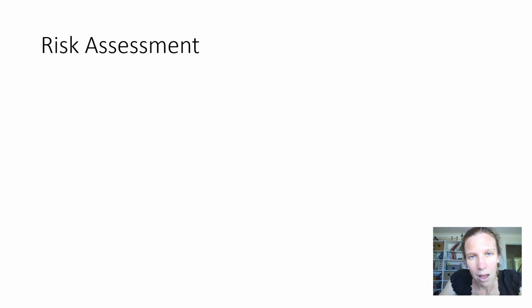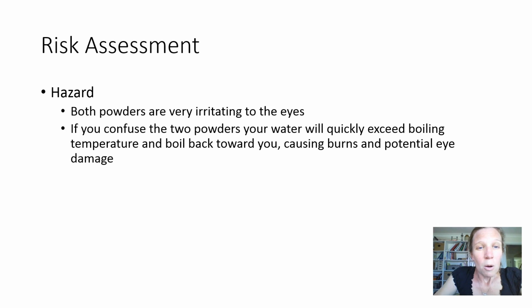Now, risk assessment. I'm going to harp on this one because it's important. Both powders are very irritating to the eyes, but much more significantly, if you confuse the two powders, in one case, your water will very quickly exceed the boiling temperature of water. And that will cause it to splash back towards you quite quickly and suddenly. And that can cause burns. It can also potentially cause eye damage, of course, if it's splashing into your face.